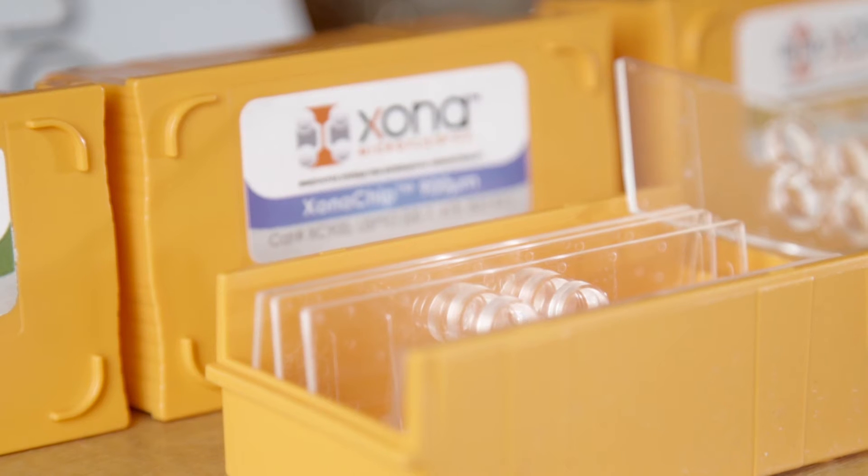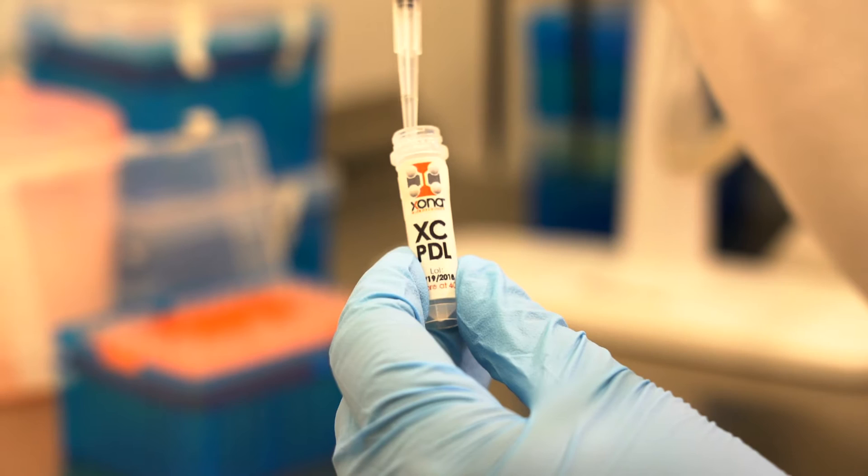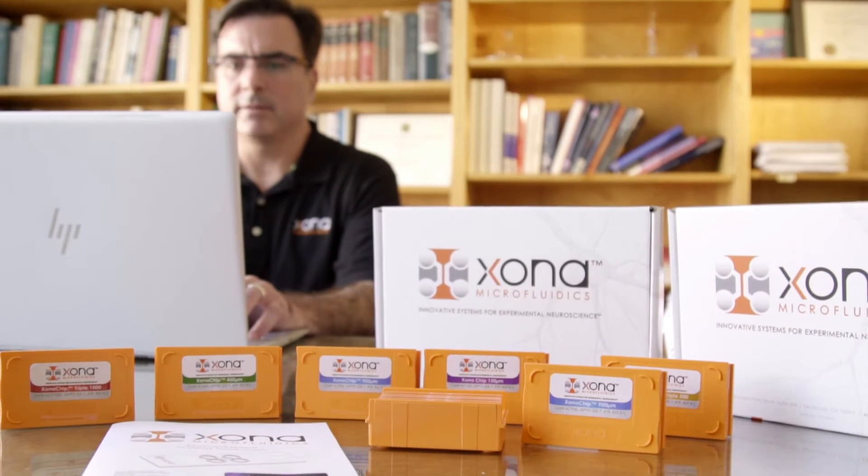It is ready to use. They're all pre-assembled and come as a packet, with a PDL solution as well — along with all different coating solutions that Zona provides.